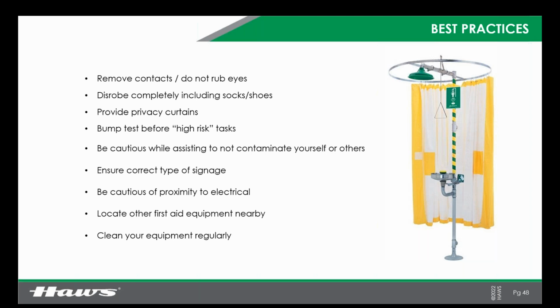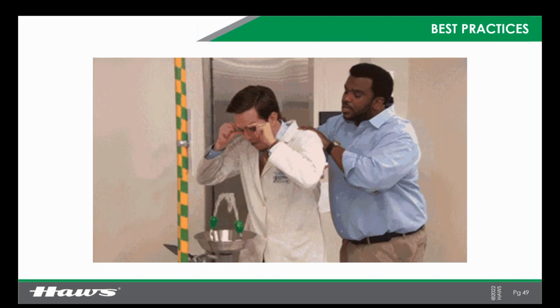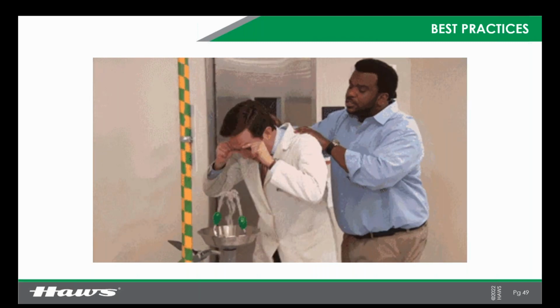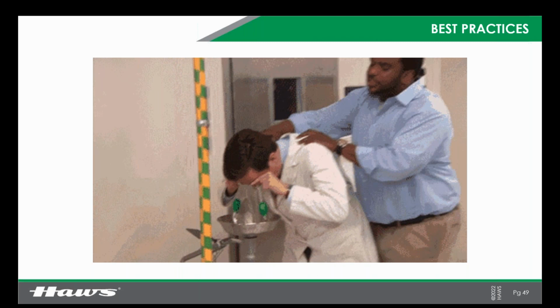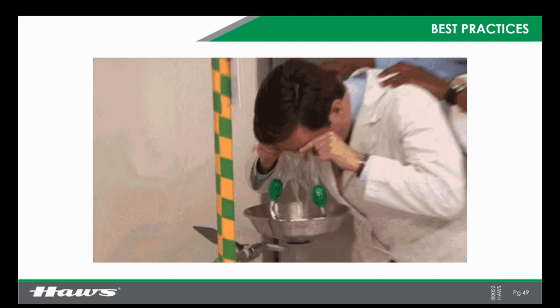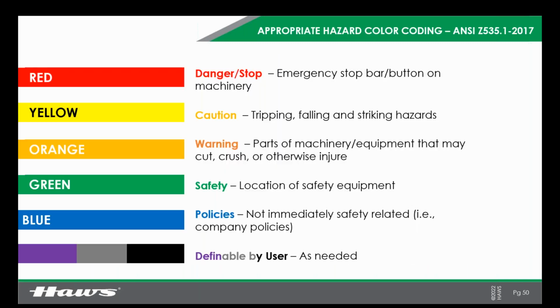Something else I wanna show you guys. This is a little silly, but I think it demonstrates proper eyewash technique, so I like to show it to people, okay? Some of you might recognize this particular scene from The Office. That's Andy. And he is screaming. I didn't want to play the audio for it, but this is excellent technique, okay? Eyewash is on, hold your eyes open. Spread them as far apart with your fingertips as you possibly can. You want that water flushing underneath your eyelids, all around your eyeball, okay? This is a great example of how to do it.